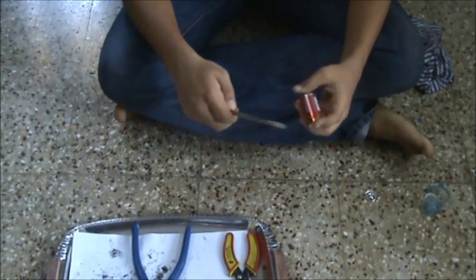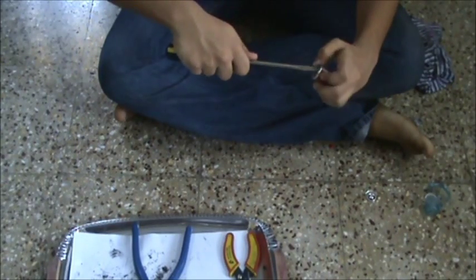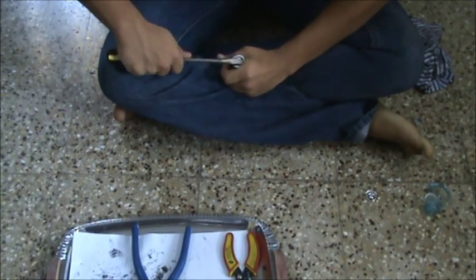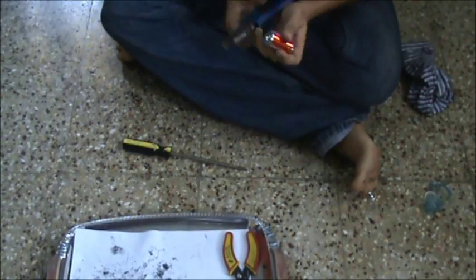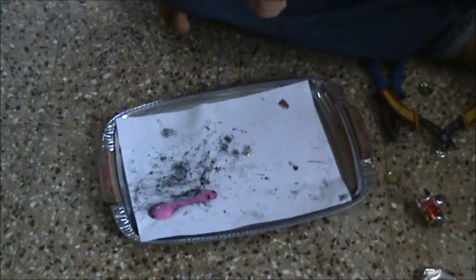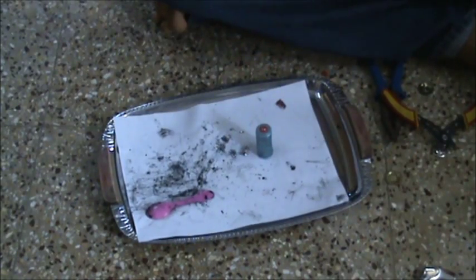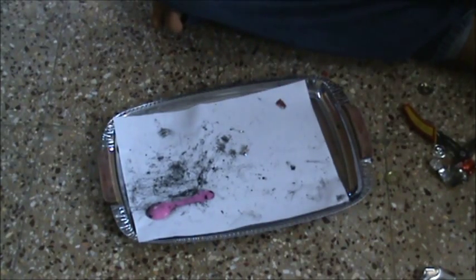So let's start. First, we will have to open up the outer metal casing of the battery. After a few minutes of hard work, you should get a battery without the outer metal cover. This was done mainly with the screwdriver and the pliers.